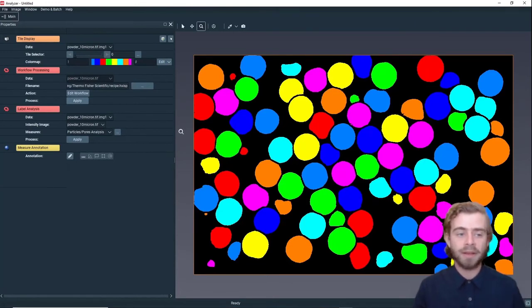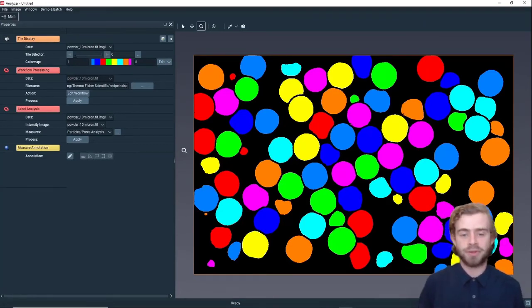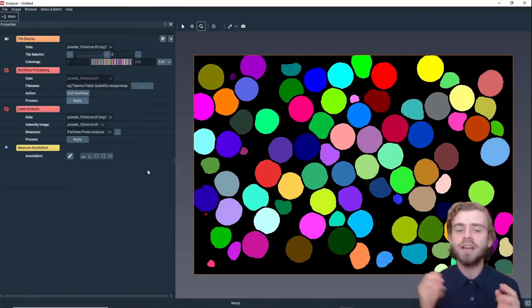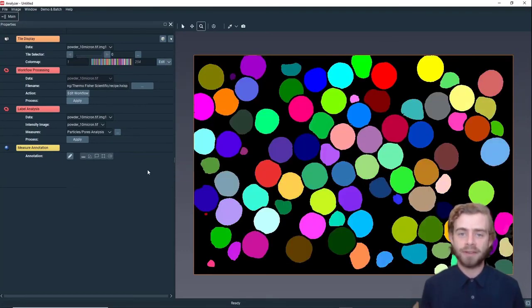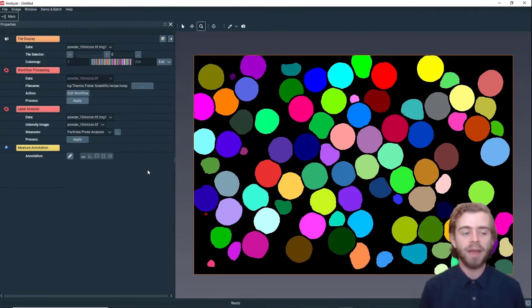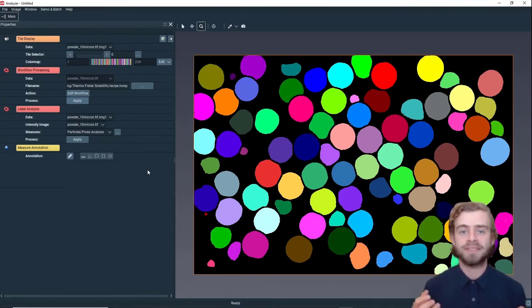It applied successfully. For some better visualization, let's change the color map to Labels 256. This allows us to very clearly see that each particle is a separate label.